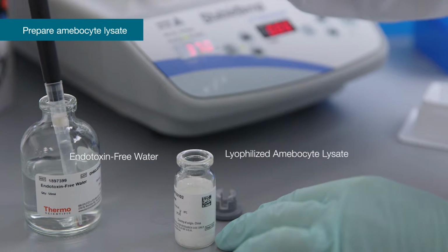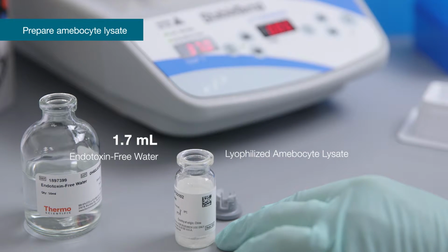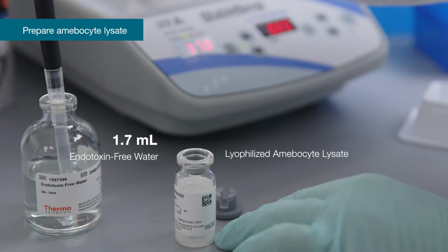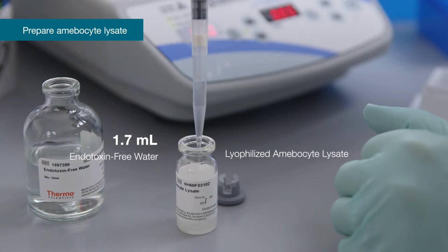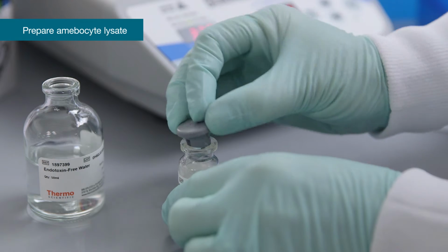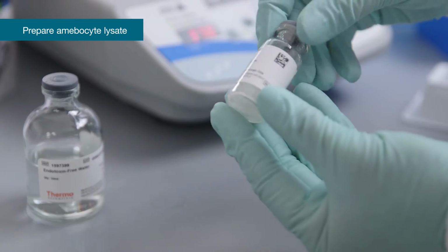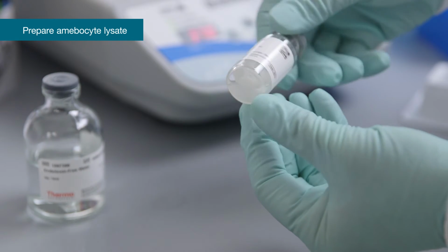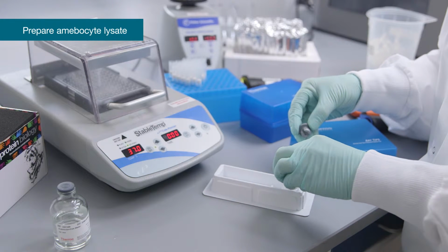Reconstitute lyophilized amoebocyte lysate immediately before use with 1.7 ml of endotoxin-free water and swirl gently to dissolve the powder. Do not vortex. Gently invert end over end to recover all of the powder from the sides and the cap of the vial. If more than one vial is required, pool 2 or more vials before use. Pour reconstituted lyophilized amoebocyte lysate into the pyrogen-free reservoir.